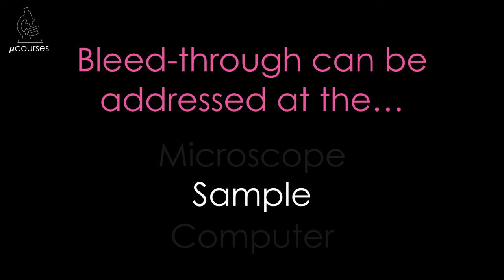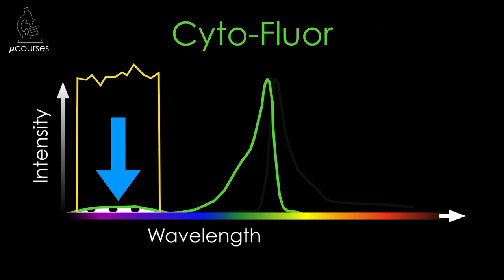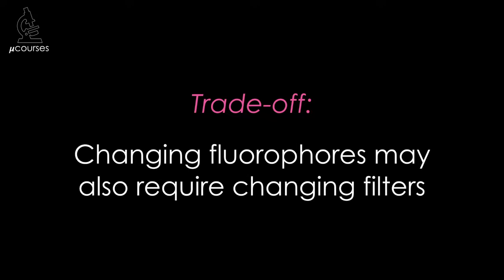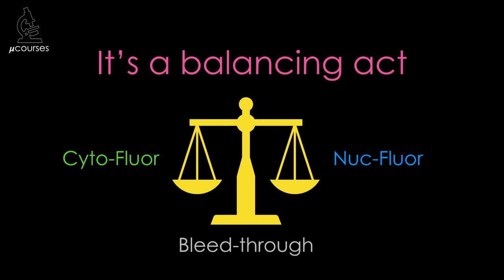In many cases — pretty much always when imaging four or more fluorophores — changing filter sets alone will not be sufficient to adequately reduce bleed-through. So let's think about adjustments to the sample and image acquisition. The most obvious change is to switch fluorophores: for example, while cytoflor is excited by filter set N, cytoflor 2 is not. But when switching fluorophores, carefully examine the spectra because you may need to change filters as well. Additional strategies involve a balancing act, thinking about the relative amounts of fluorophore present and the amount of photons collected when acquiring images.